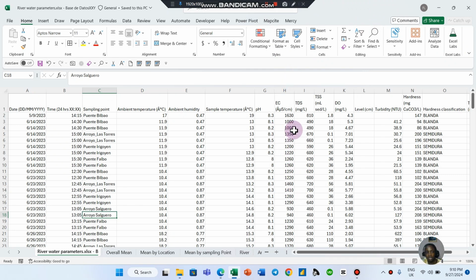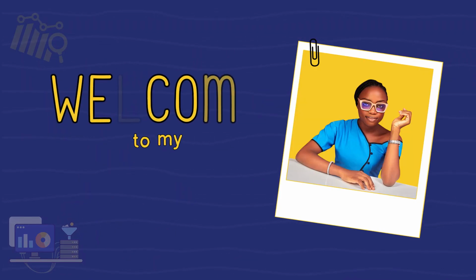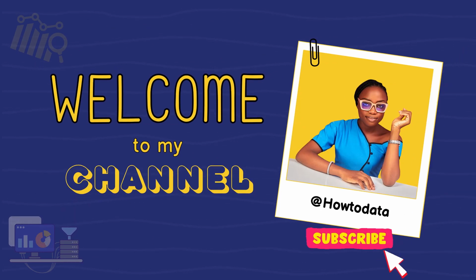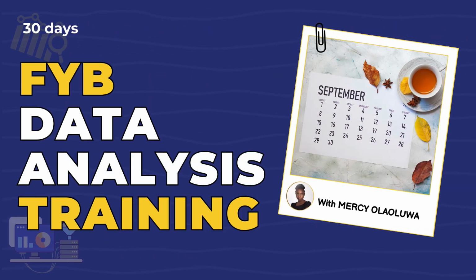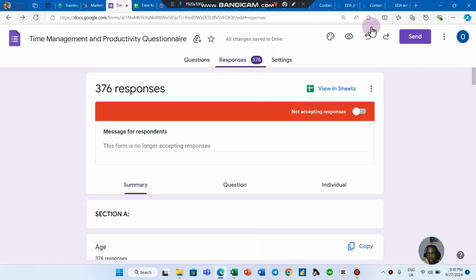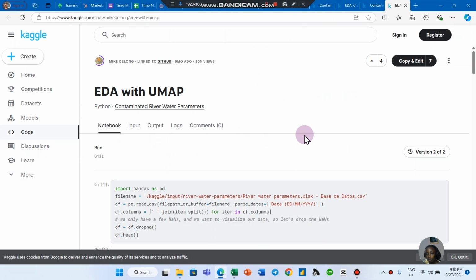So in this video, we'll also be working on a project, and this project is that of the data that is generated in the lab. So this is the data set, and this is what the data set is about: water samples that are gotten from a river and from some streams.